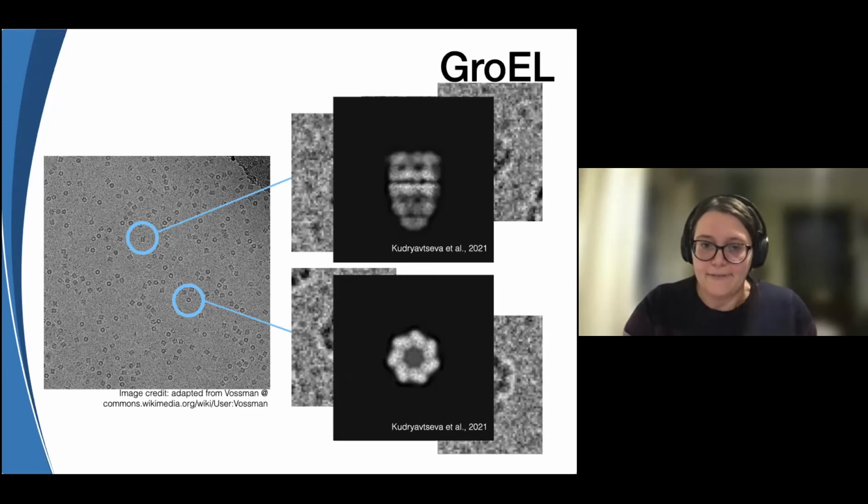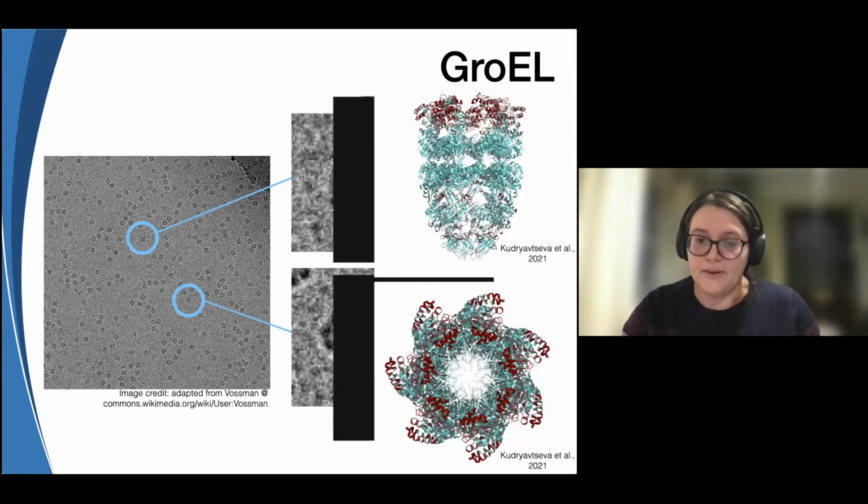But what you have is, from this image and using the power and the resolution of the electron microscope, the ability to resolve really tiny features inside proteins. And again, from those types of images, with a lot of modeling and a lot of computational work, you can figure out exactly what types of atomic arrangements are where. You can see some coiled structures, for example, on the outside. And from here, try and understand how this protein works.